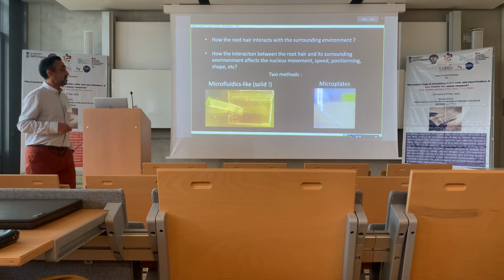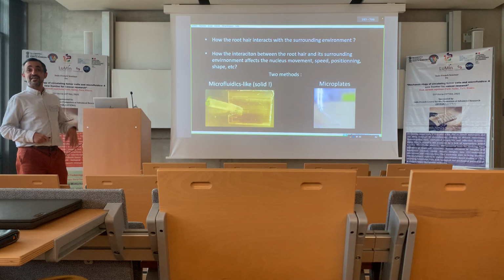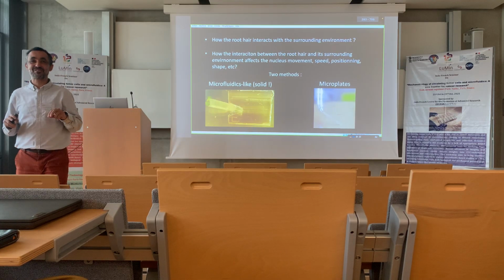We do two kinds of experiment with this. In one, you have the plantlet here with the leaves. In this tube the root grows, and you have a big channel and lateral channels. This microfluidic device is not fluid, it's microsolid.